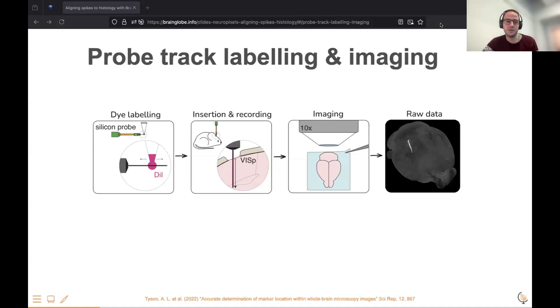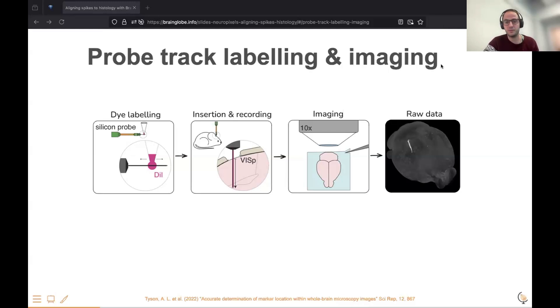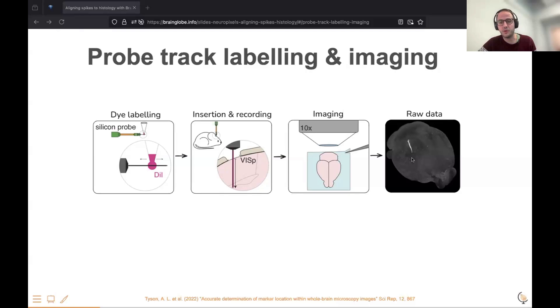The tools I'm going to talk about today are typically used when you do whole brain imaging. You might clear the brain and image it with a light sheet microscope, or the data I'm showing today is from two-photon serial-section microscopy. This is what it looks like: because of the dye, you can see that the probe shows up as a very bright region in the mouse brain. You can see the olfactory bulbs at the front and the cerebellum at the back.